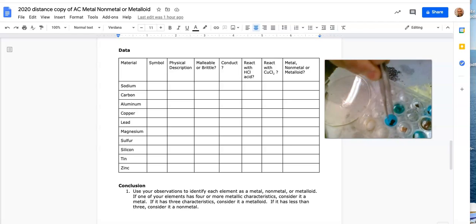Well, the zinc reacted very quickly with the copper chloride. You can see how dark it turned. I think the camera wasn't on it right when I set it in there, so I'm going to do another one. Starting out shiny, then when I drop it in, it turns dark very quickly. Again, the copper and the zinc are swapping places.